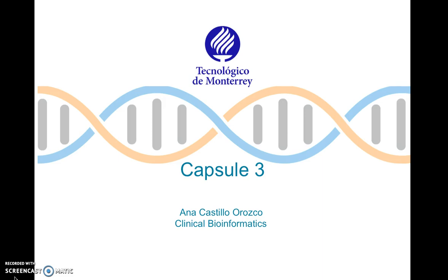This is our third capsule, and I think it will be a very interesting one because we will learn how to design primers. As you know, our next practice is PCR, so I think it will be very useful to you if you know how to design those primers. And we're going to work using an example in a medical case, and I hope you enjoy it.